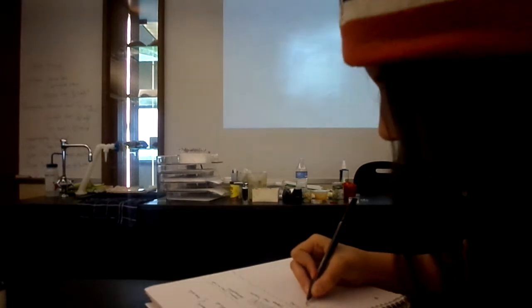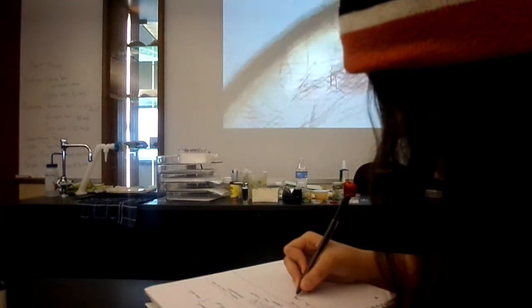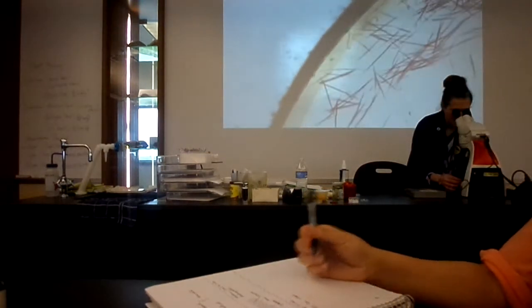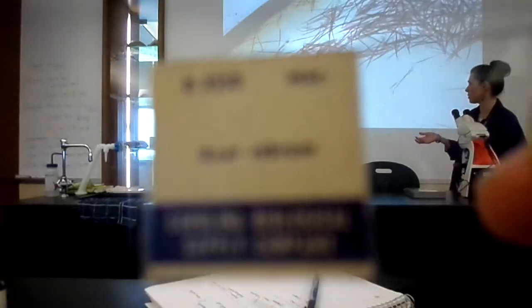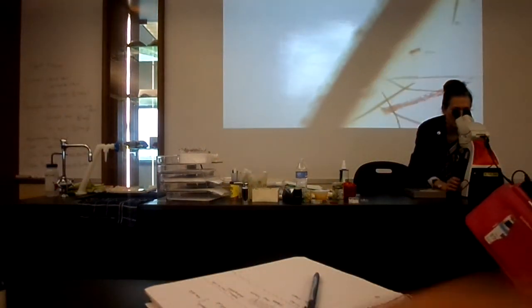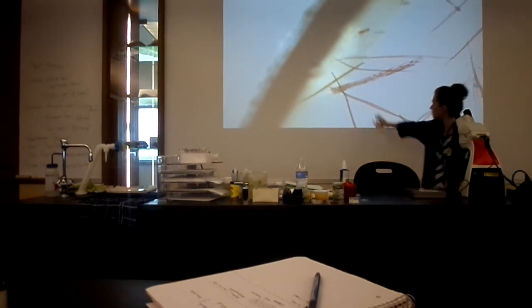Just in case you wonder what kind of plant it is, I'm not going to ask you from what plant this came from. But you want to look for these little guys that look like little matchsticks, okay? That's what we're looking at. I'm going to go to this little cluster right here because it's really cool to see them all together. And then I'm going to show them to you separated. So I'm looking at this little cluster right here. That's a bunch of cells.